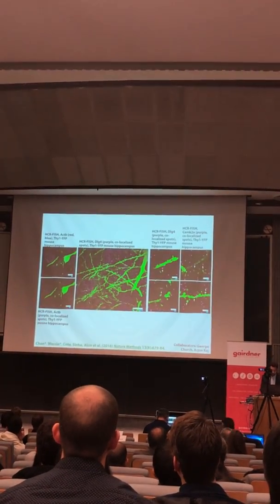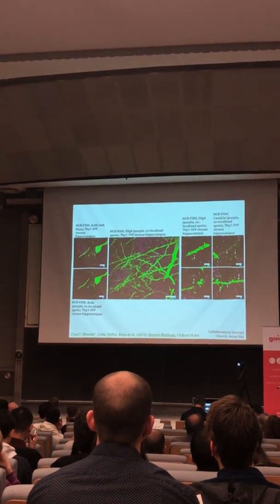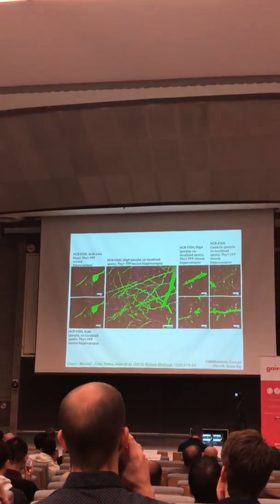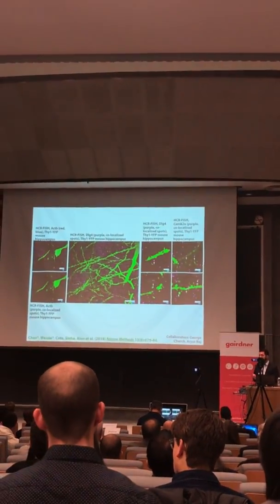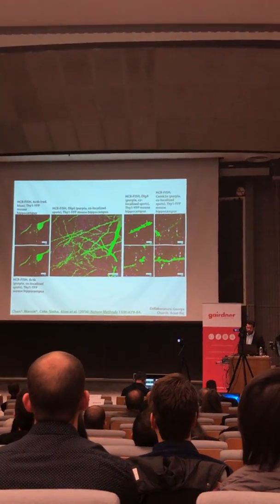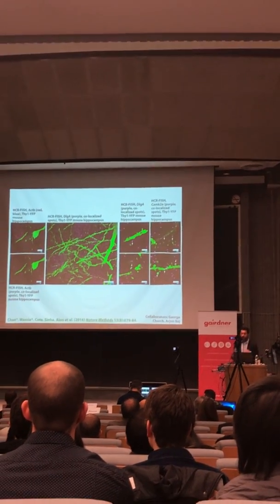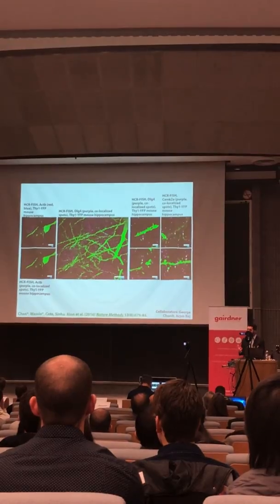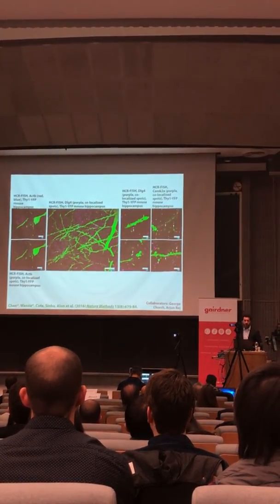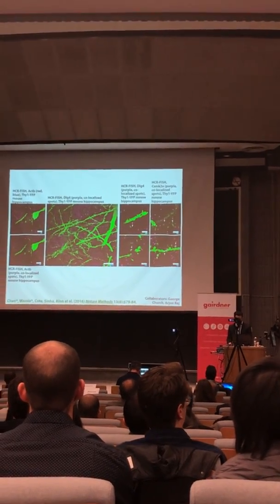This is a paper we recently did where Oz Rossi had joined our team, and we worked a lot with Alison Coate and Arden Rada's group as well. And we could anchor both proteins and nucleic acids that expand, and then image the location of individual messenger RNAs with nanoscale precision, even in intact brain tissues. And that's very interesting, of course, because neurons have one nucleus, but thousands of connections. Understanding how gene regulation is controlled at a spatial level might be very important for understanding learning and memory, disease progression, and other kinds of important functions and flaws in the nervous system.